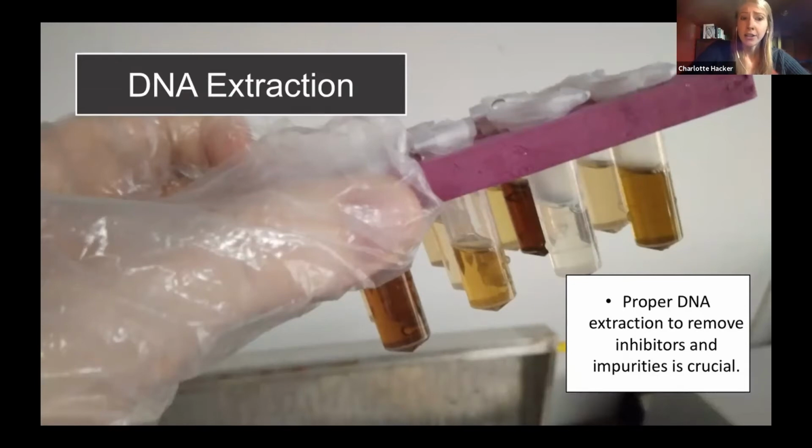And then extraction is a crucial step because DNA from scat in general has a lot of impurities and inhibitors attached to it. And so extraction is going to remove those impurities and inhibitors, which is going to make it easier on down the line for you to continue working with that DNA.